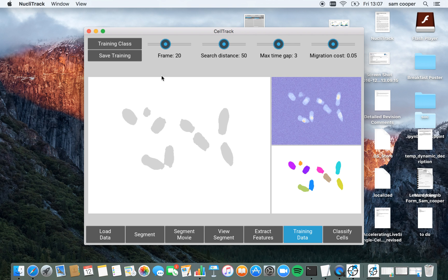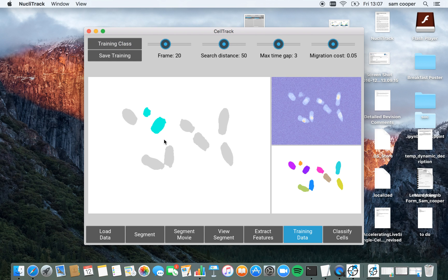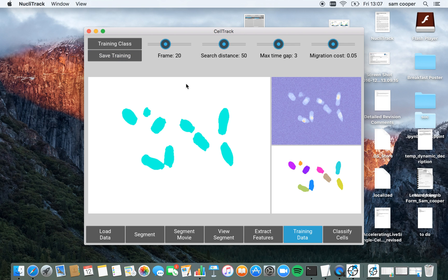So now that I'm happy with the data, you saw me clicking it accidentally again earlier, but I'm just going to update it further. I'm going to click save training and this is going to save all of these classes for classification and tracking later.